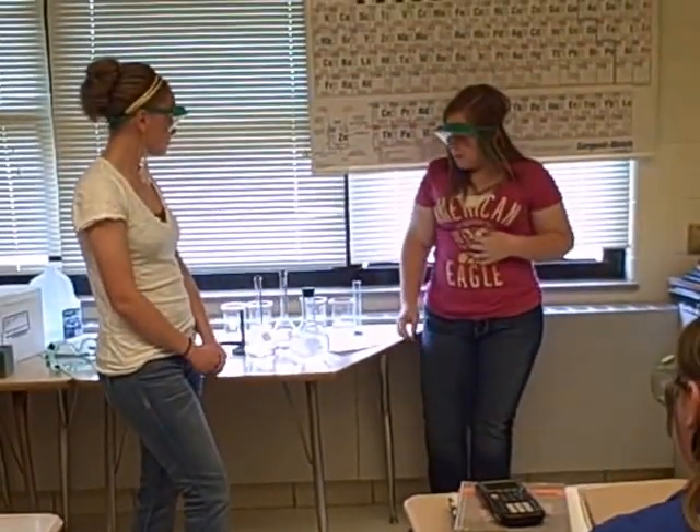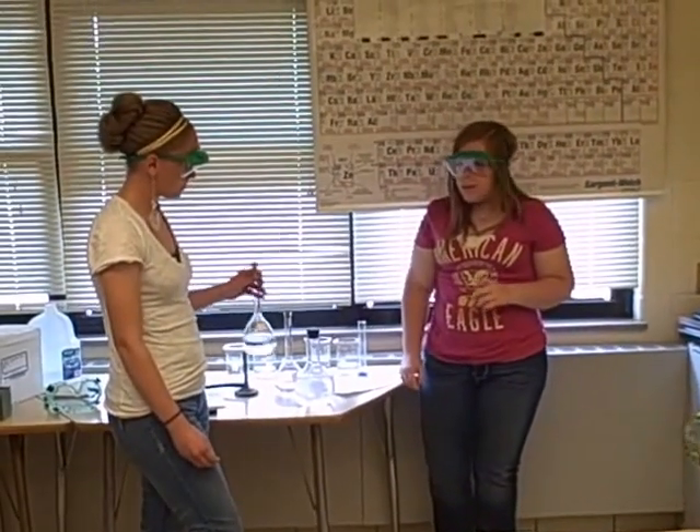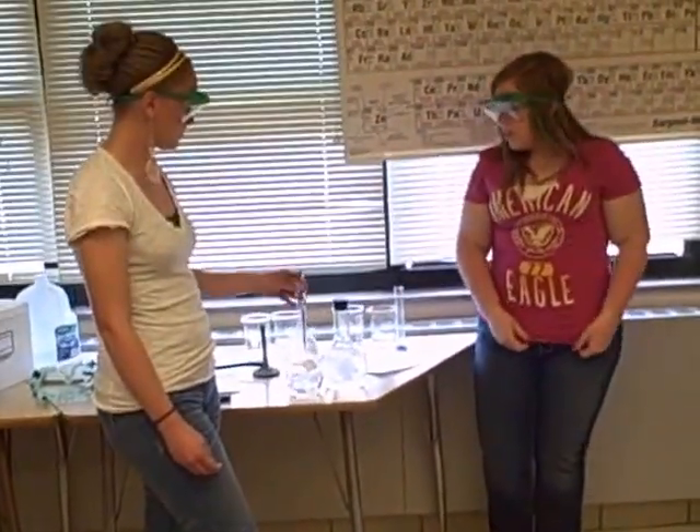Our experiment is called the Iodine Clock Reaction, and we are mixing two solutions. One is sodium metabisulfite, a starch solution, and distilled water. And the other one is going to be potassium iodate and distilled water.